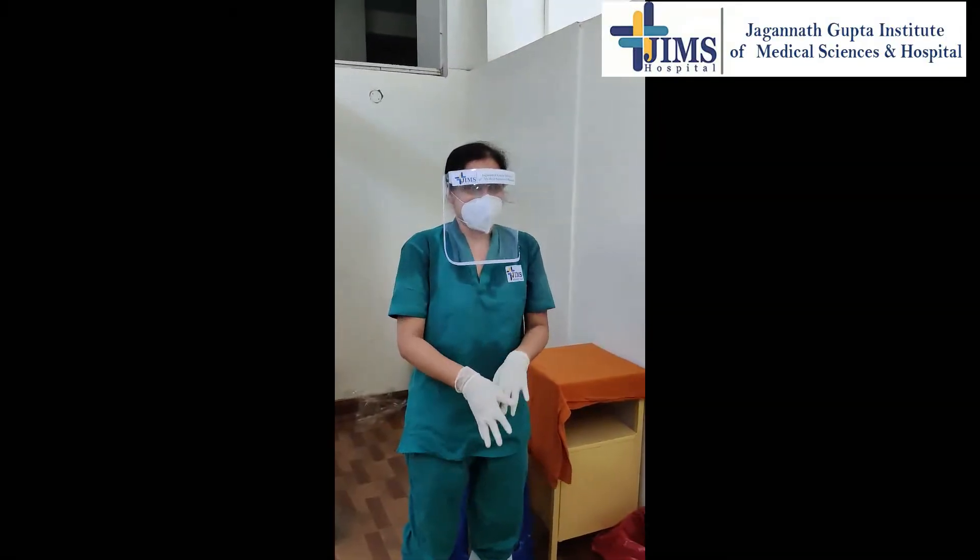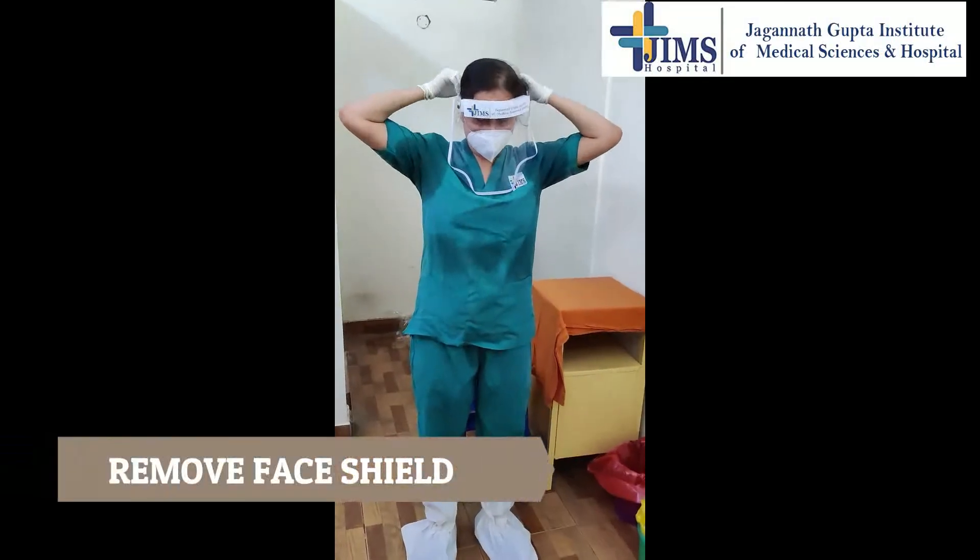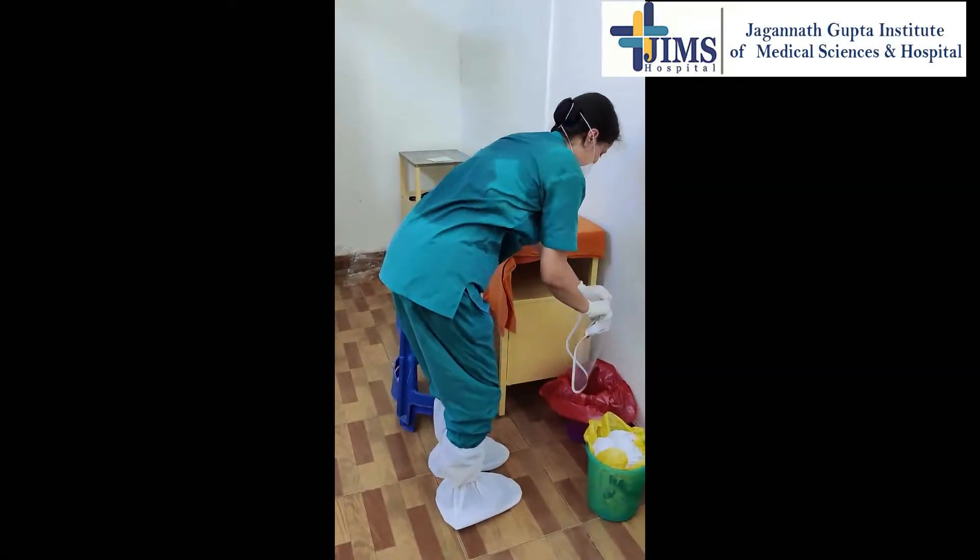Perform hand hygiene on the gloved hand. Remove the face shield from behind the head and dispose of it safely.